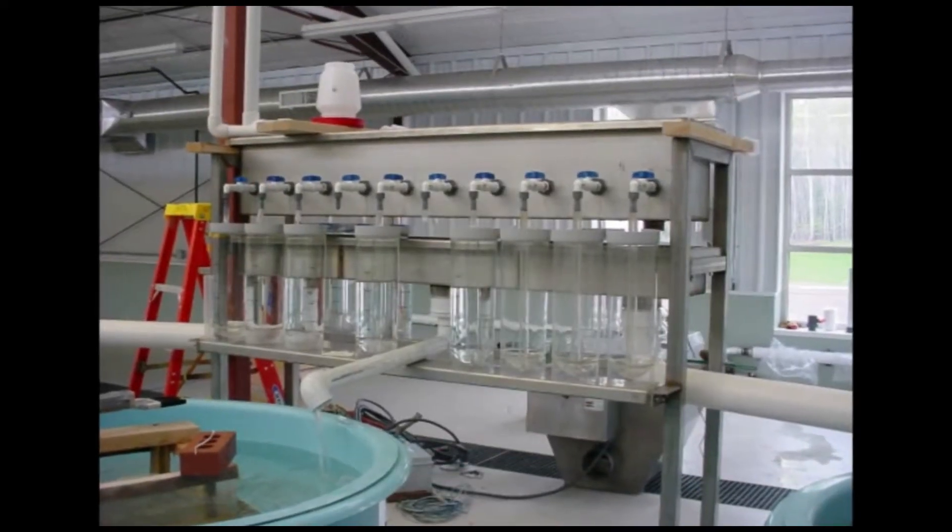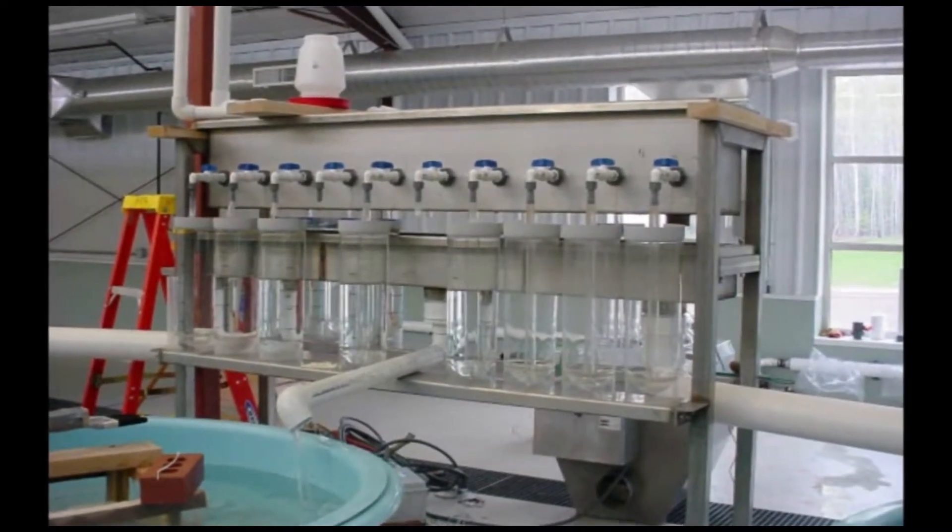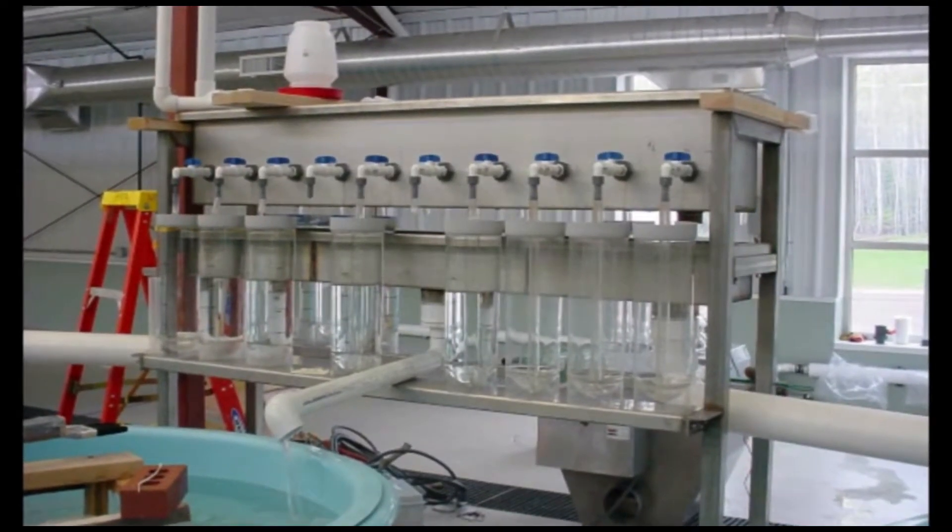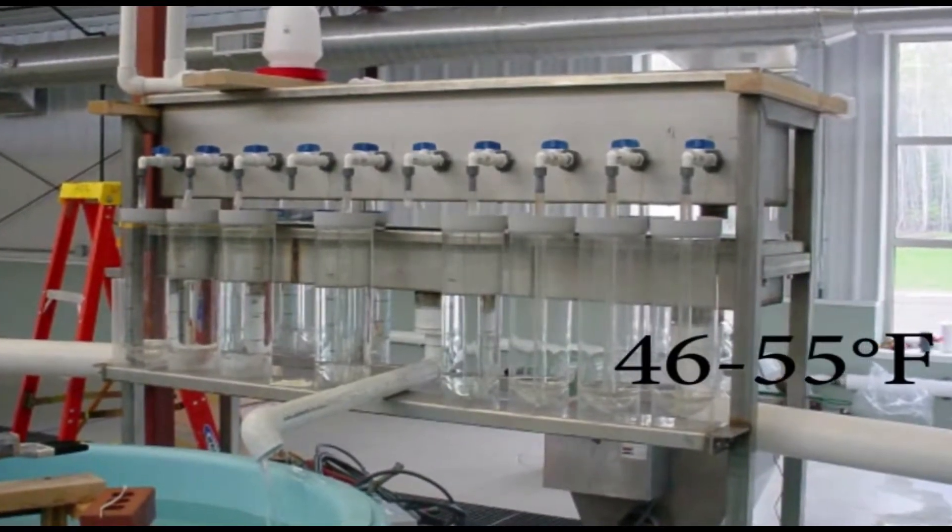At UWSP NADF, walleye eggs are incubated in a bell jar incubation system which offers aerated well water at appropriate temperatures ranging from 46 to 55 degrees Fahrenheit.